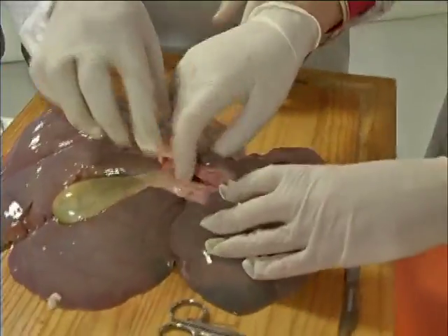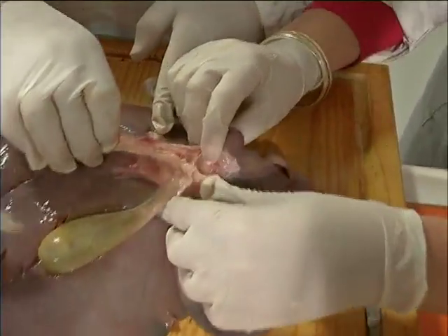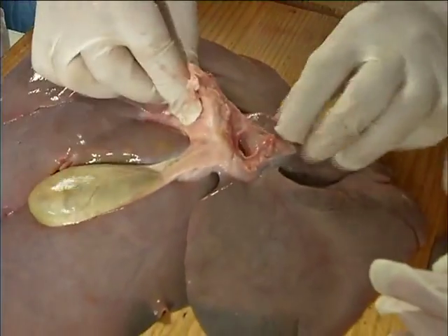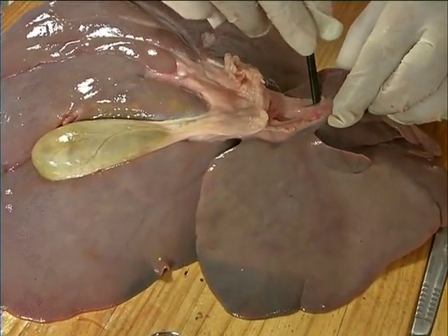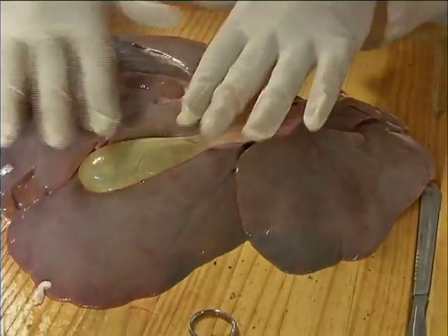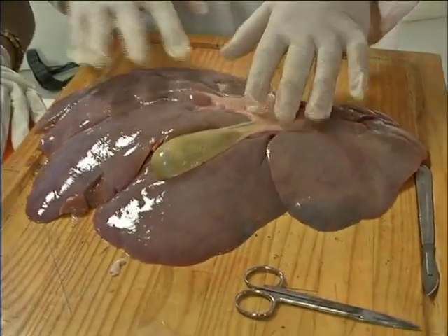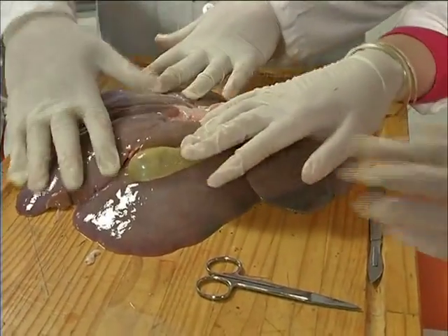Turn it around. If you have a look at it, that is where the bile comes out. Is it on the other side? There it is. See the little hole there? It goes in there, into the liver, and then that is out where the bile is going to come out. I don't want to mess around with this too much because bile is very yucky, and we don't want to contaminate the piece of meat because it's quite a nice piece of meat.